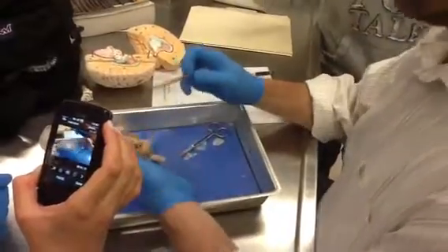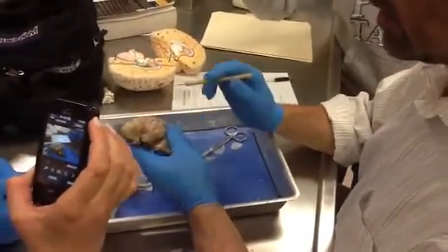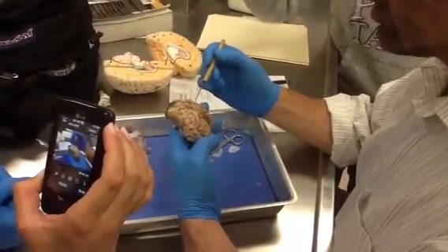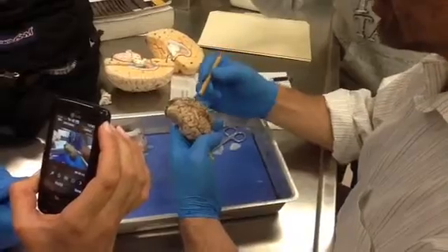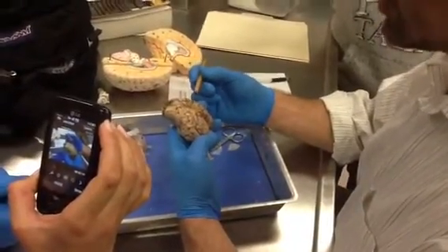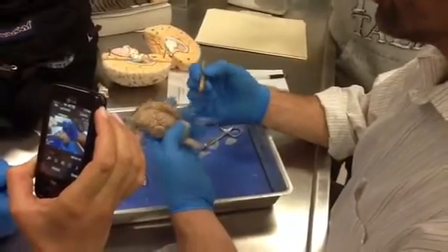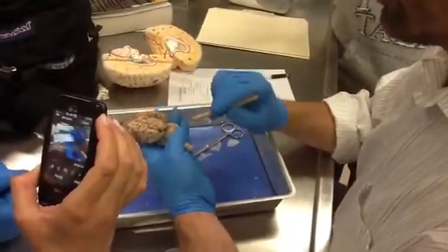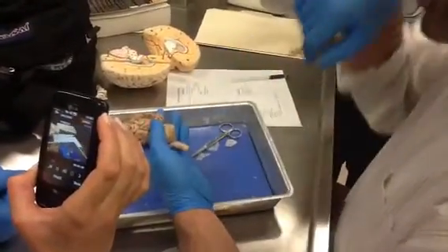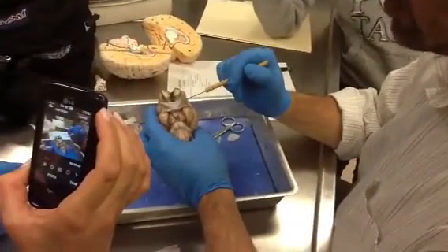Okay, and then you should be able to identify the lobes. You can kind of see the temporal lobes are on the side. The central sulcus is really, there's only one sulcus that kind of does come straight across like this. That would be it right there. You can't really see the pre and post central gyrus so well. I won't ask it on here. On the brain you can on the model. Frontal lobe, parietal lobe, occipital lobes are back here if I point back here. Cerebellum. All right. We already talked about olfactory nerve 1, cranial nerve 2.